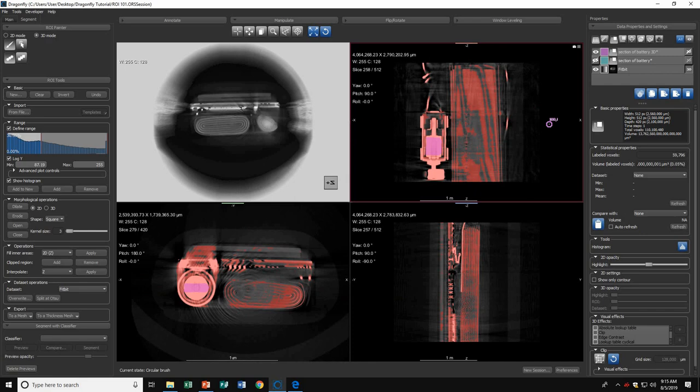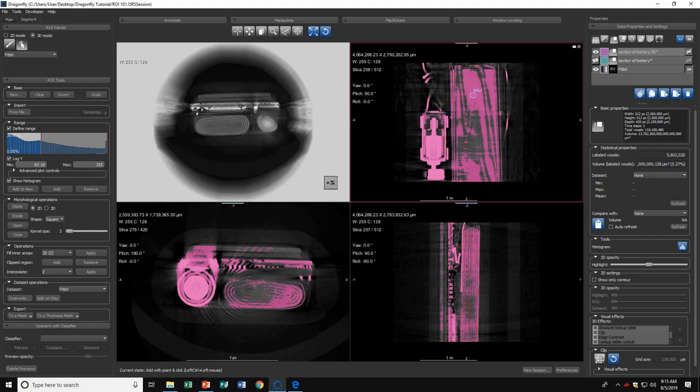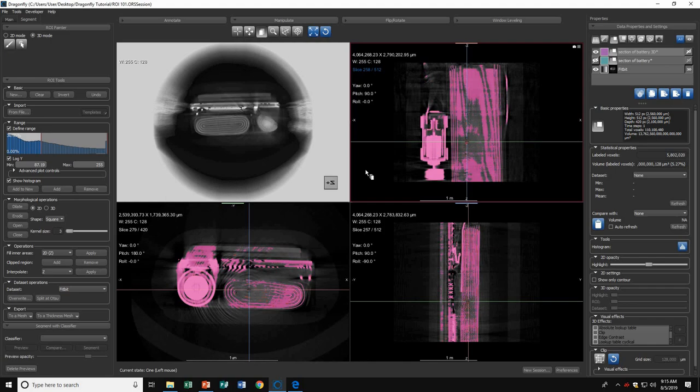Another good tool in 3D mode is the Point and Click tool. When you use it, it will paint the entire region on that one slice that is within the range and also paint it through multiple slices. For example, if I click here, everything within my range has been highlighted and has gone through every single slice. My entire range has just been highlighted.